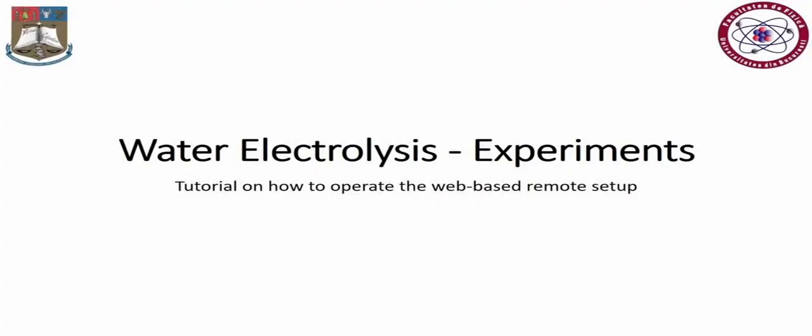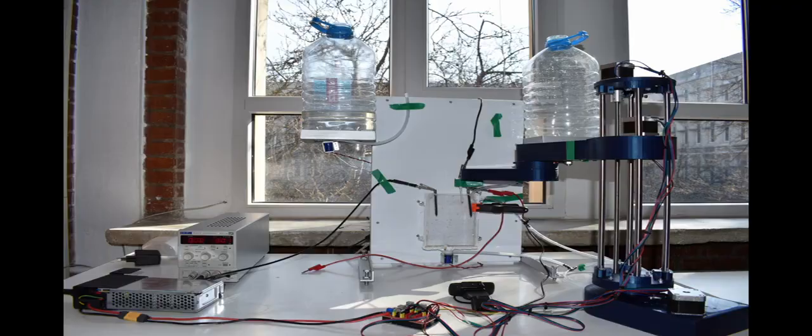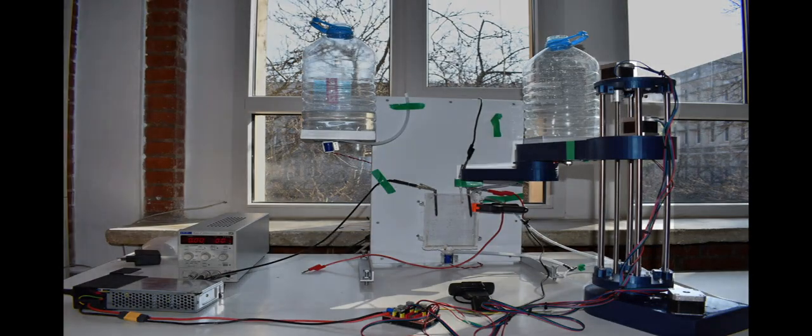This video serves as a tutorial on how to operate the remote experimental setup designed to study electrolysis in our laboratory. This is our setup.